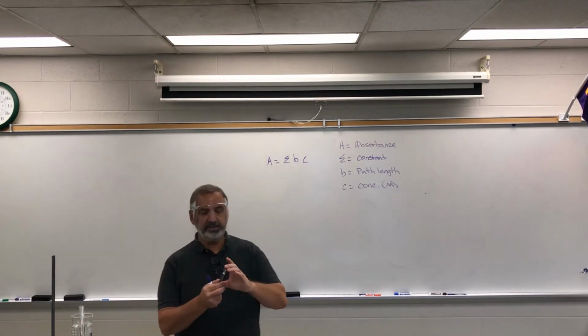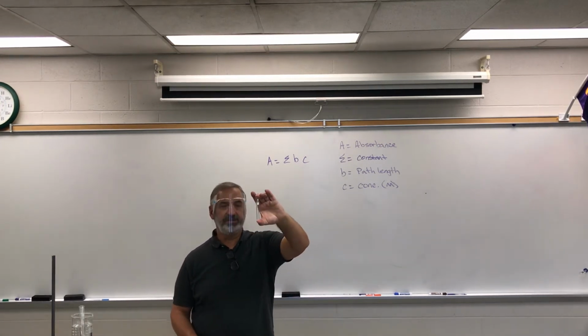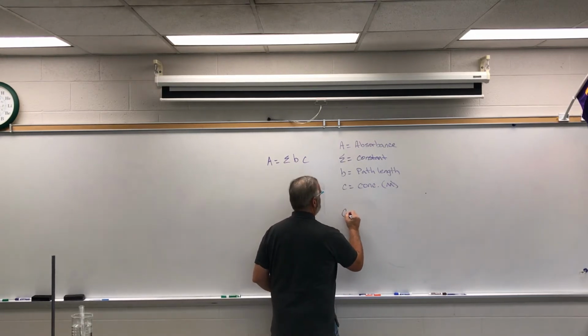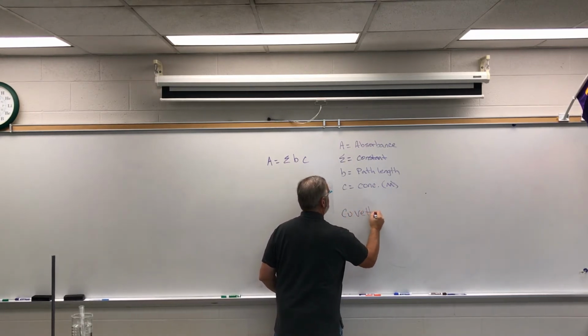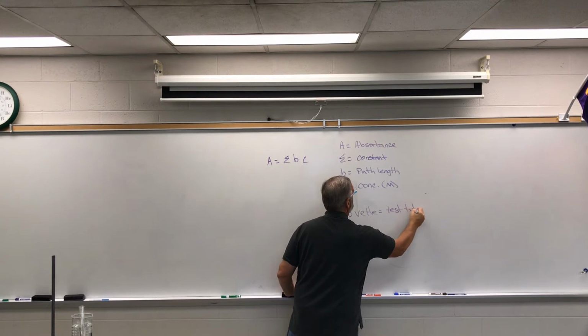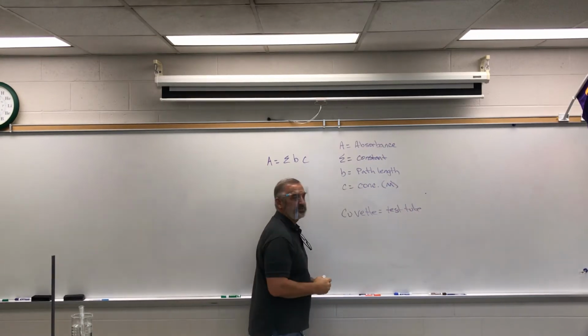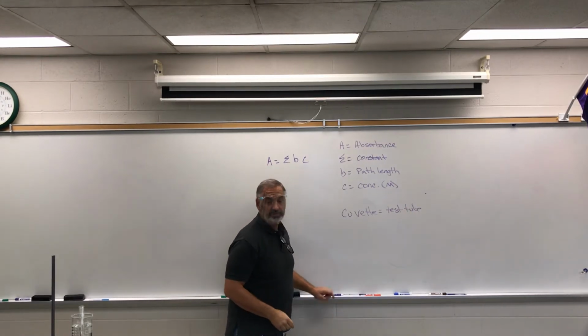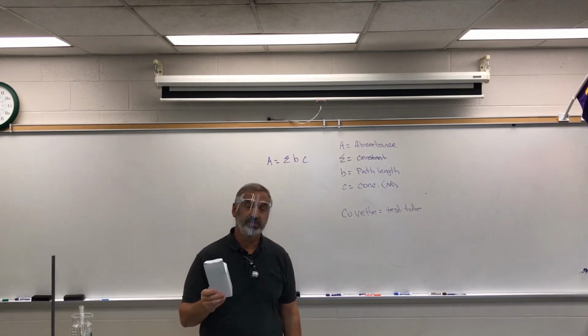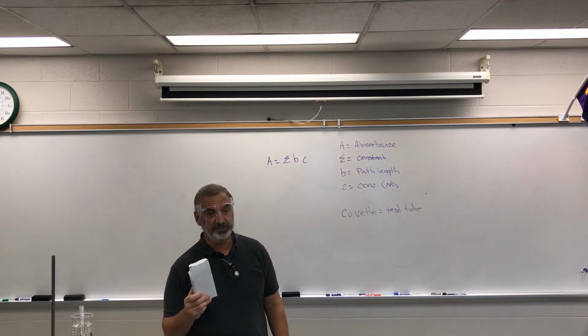Now we're going to be using these things that are called a cuvette. Kind of like a Corvette, but the cuvette is basically a test tube. But it's a fancy test tube. It's an expensive test tube. Most test tubes, 12 of these would cost $1 at the most or so.